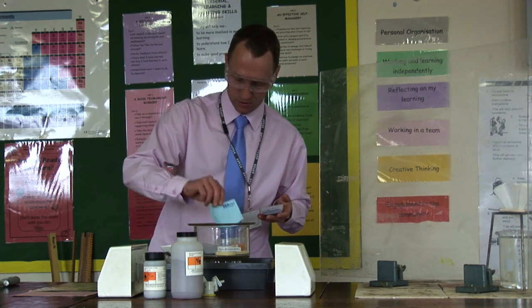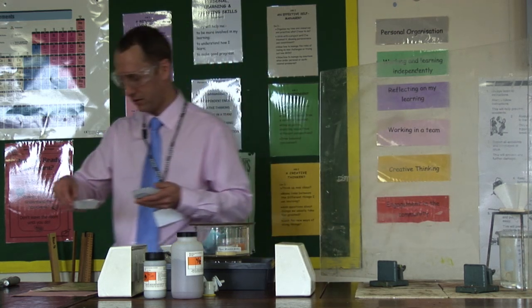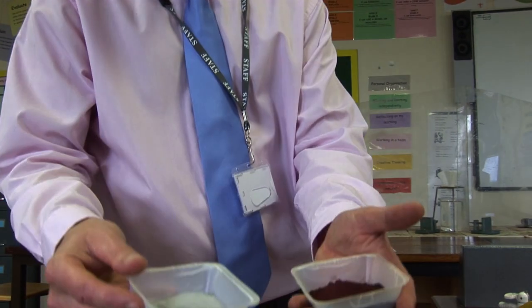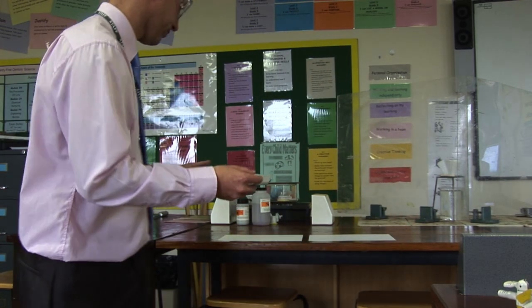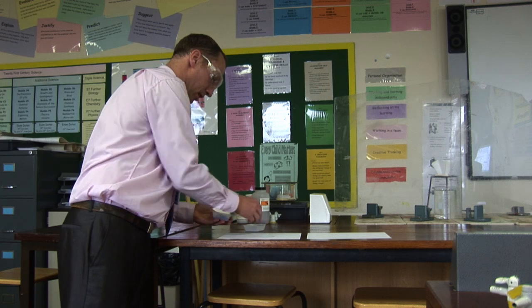You can see the difference in colour — I'll bring them over to the camera so you can have a good look. You want to get the mix as accurate as possible. You can see the difference in colours here: aluminium powder on your left and iron oxide on your right.